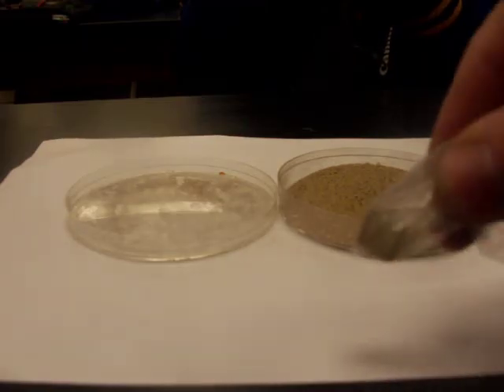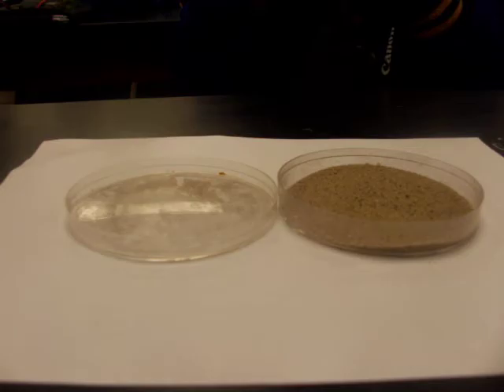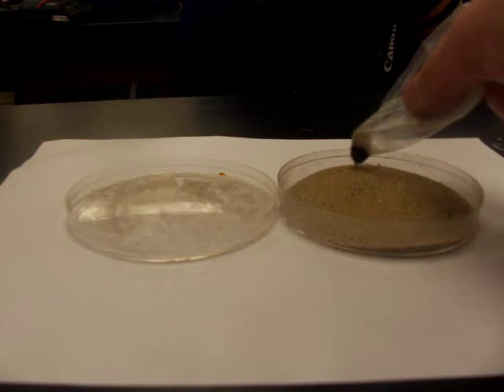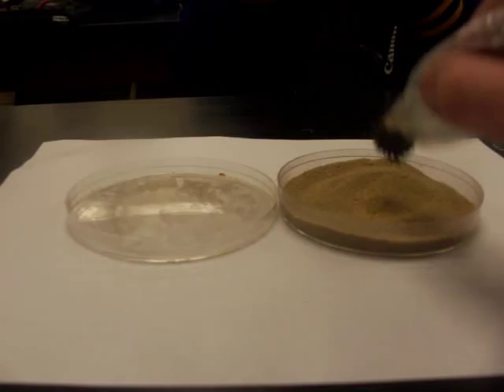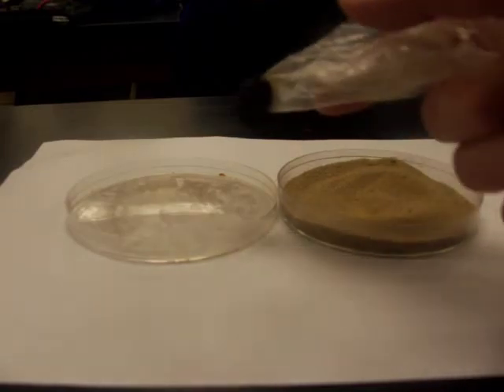I've placed my magnet inside a bag so it's easy to get the iron off of the magnet. Being a strong magnet, it can hold on to those iron filings. If I bring the magnet near the mixture, we can see the iron filings jumping up onto the magnet. Going down in there, we can really begin to see that iron separate itself from the sand and salt.